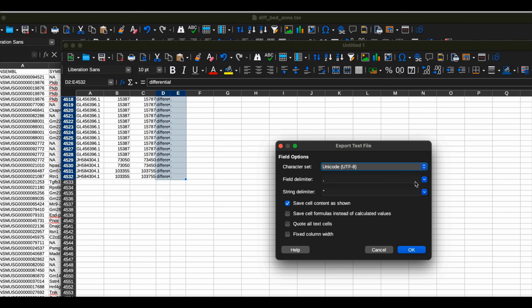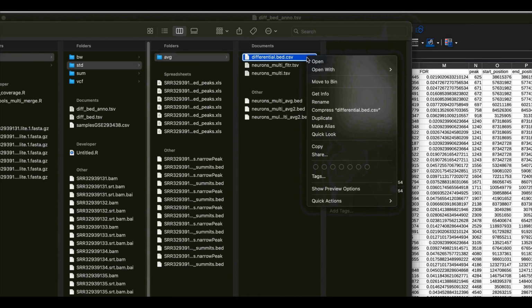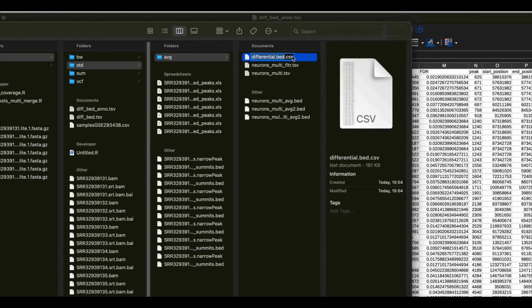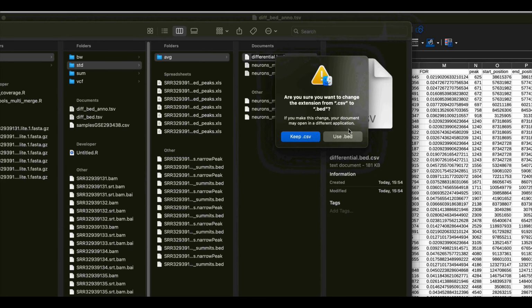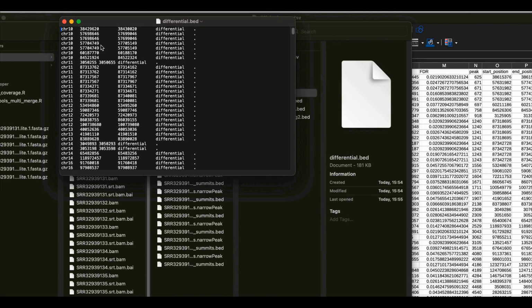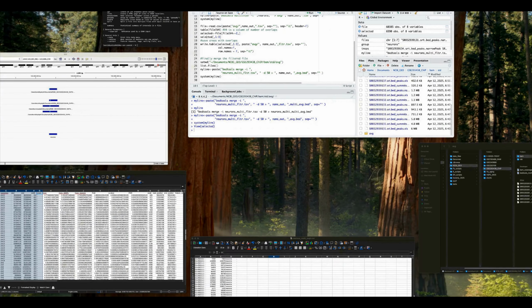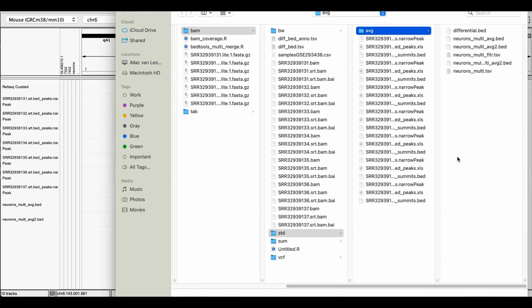CSV, and then the field delimiter should be tab. String, okay, I don't care, probably, okay. It's still not okay because it's adding CSV. So remove CSV, use bed, check inside: chromosome, start and name, orientation, and now it is ready to be loaded.